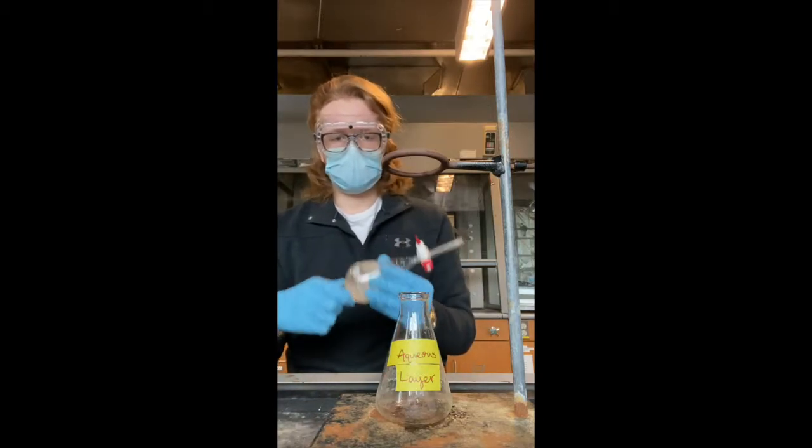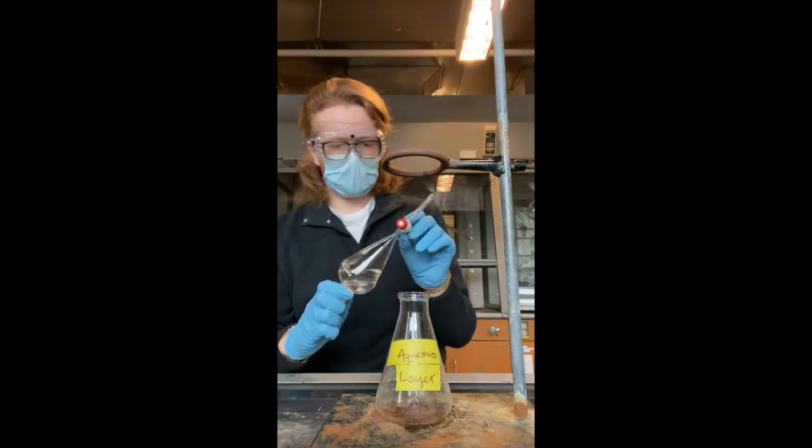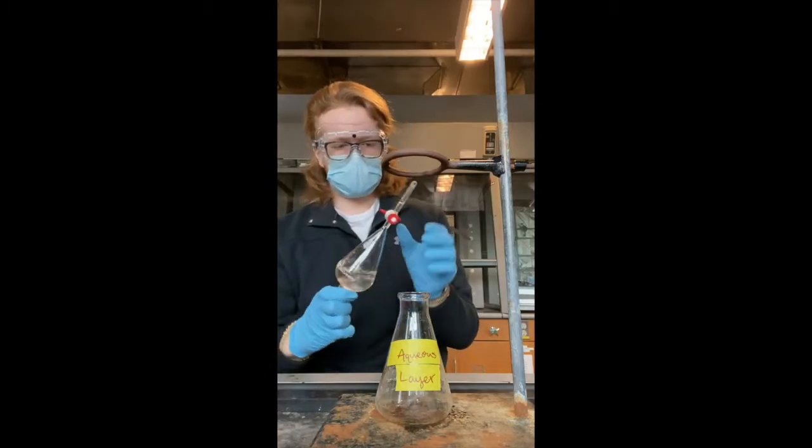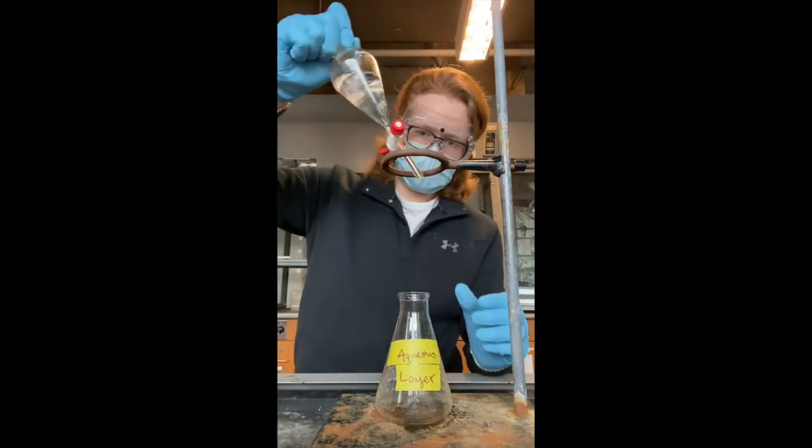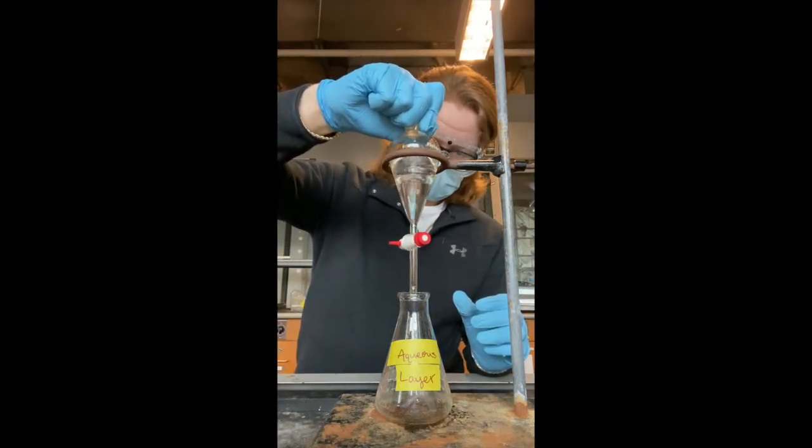Once again, open the stopcock to release the pressure and close it before shaking the separatory funnel, then open the stopcock again to release the pressure and close it before continuing with the shaking, completing this process 3 times as you have just seen.